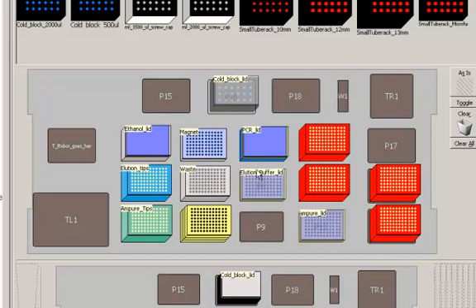We have elution buffer and AMPure. They're both lidded. They're 96 well hard shell plates. They have lids on them to minimize evaporation. When it comes to adding the AMPure step, the FX will remove the lid. Use your 96 AMPure tips to transfer the AMPure to your PCR plate. You only need to have AMPure in the wells that correspond to your pattern and you only need to have elution buffer into the wells that correspond to your pattern.